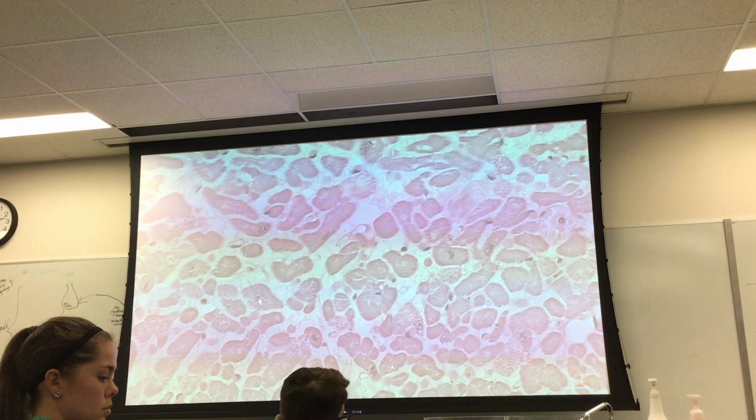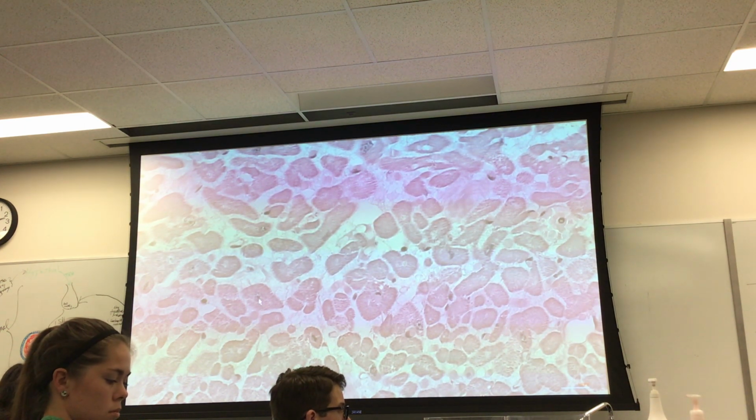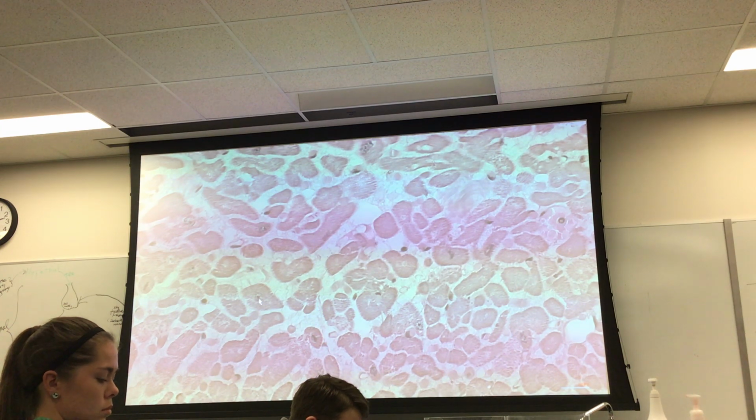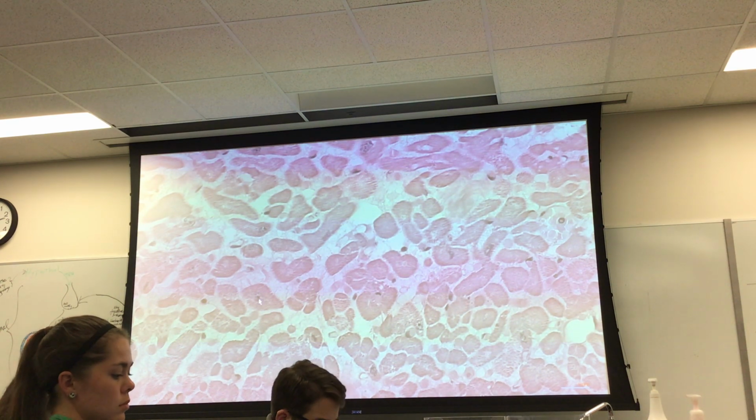Now, with nervous tissue, what we talked about was central nervous system versus peripheral. If it's peripheral, it's either a sympathetic or parasympathetic ganglion, depending on whether you're in the organ or not, or a dorsal root ganglion. You get that. Central nervous system, it's really just all the spinal cord anatomy that we did as far as the different cell types. Now, the other thing that we really didn't talk about, but I'll show you now, is this.